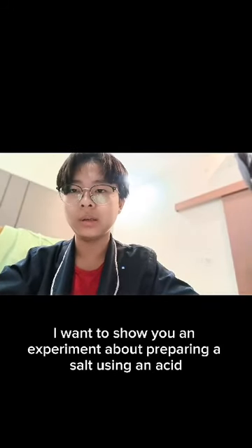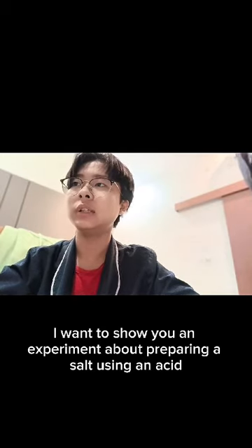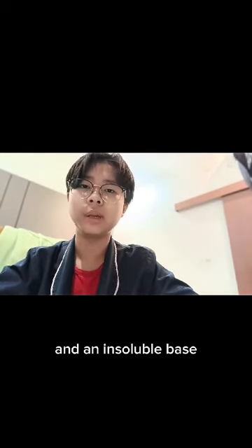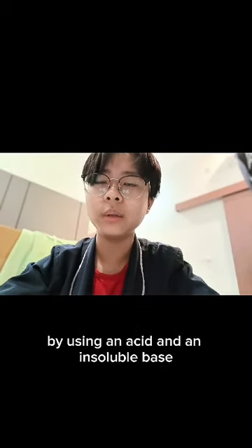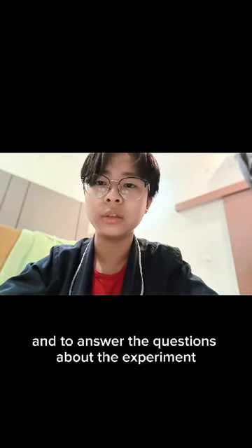Hello everyone, in this video I want to show you an experiment about preparing a salt using an acid and an insoluble base. The aim or goal of this experiment is to prove that salt can be formed by using an acid and an insoluble base, and to answer the questions about the experiment.